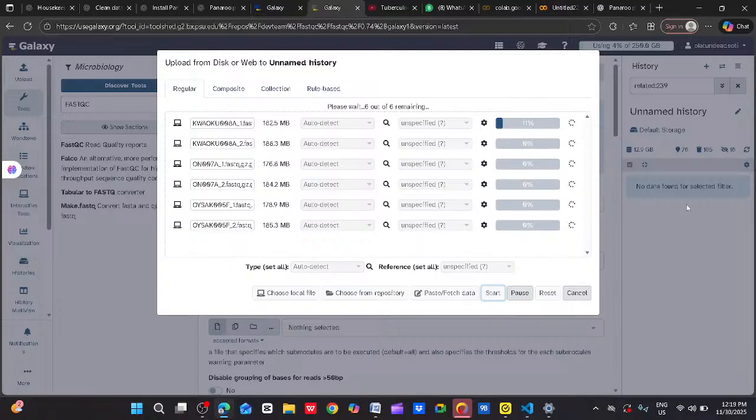Okay. Let us wait. This is going to take some time, and it might take as long as 1 or 2 hours, depending on the available internet speed. So please let it go. Let's wait and see the progress.